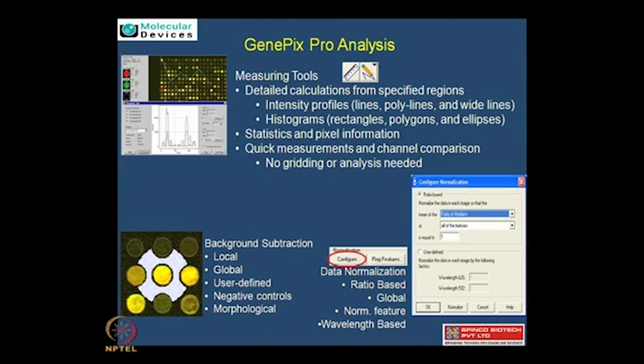As you elaborated in the last lecture, there is also the user defined one. Say for example, you have a positive control, you have a normal control, you have also got a shape control, morphologically different ones. You calculate them as features and allow the configuration to decide which one to go for. You also have a negative control, which gives only the negative background in the same area of defined other types. I guess we discussed the need for these controls, right? How important those are, and now we can see it here, when we are acquiring these images, how each of the positive and negative control features plays a crucial role in the analysis process.